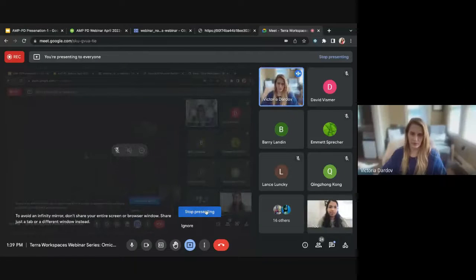That was really great. Thank you so much for walking us through that and just the steps it takes to set up a workflow. That was really great to see how you set it up, especially because I've seen the end products and I've run the end products, but I've never actually seen how to do it. So that was really great. Thanks so much for walking us through that. Were there any questions that anybody had?